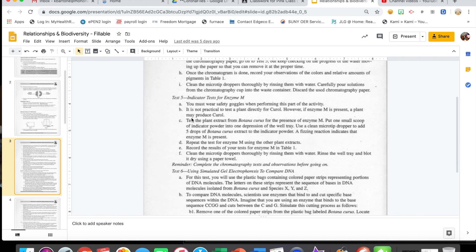It is not practical to test a plant directly for Curol. Remember from the first video that Curol is a potentially cancer-curing agent found in small supply in Botana curus, and we're looking for a closely related plant that may also produce it. However, if Enzyme M is present, a plant may produce Curol. We'll put one small scoop of indicator powder into the depression well tray. A fizzing reaction indicates that Enzyme M is present.